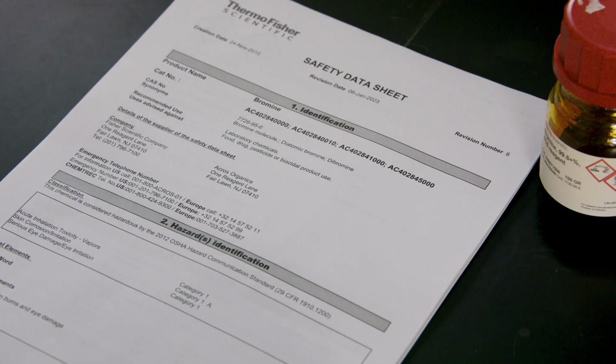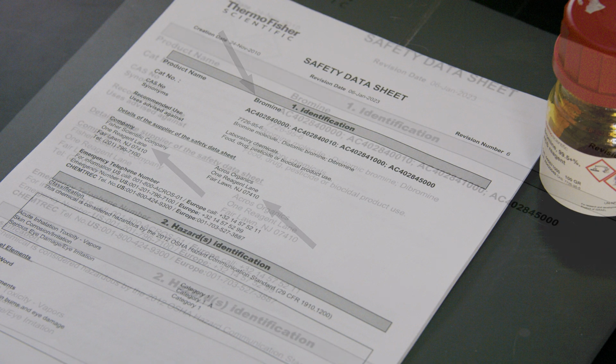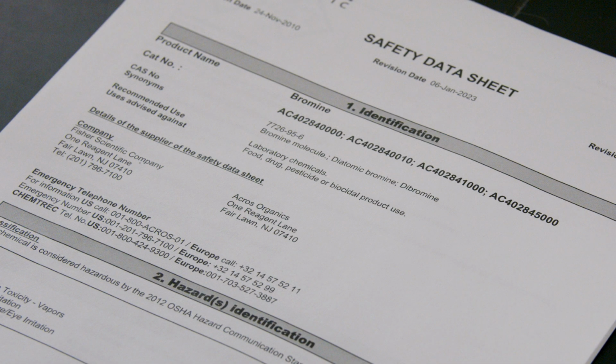First, take a look at the cover. You'll find the chemical's name and the manufacturer's information. This provides a quick overview of the substance. Let's dive into Section 1, Identification. Here, you'll find the product identifier, like the chemical's name or code. Plus, you'll see any recommended uses, which can clue you in on how the chemical should be handled.